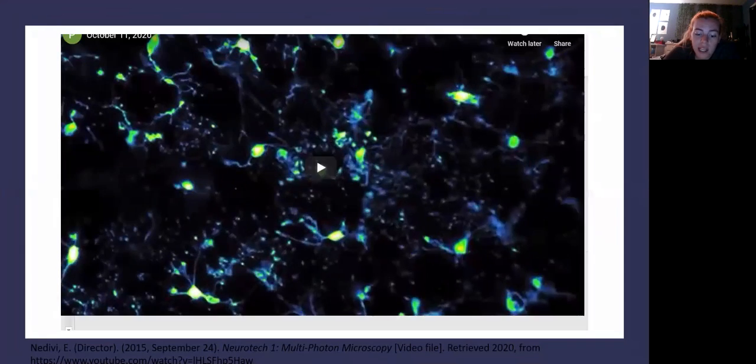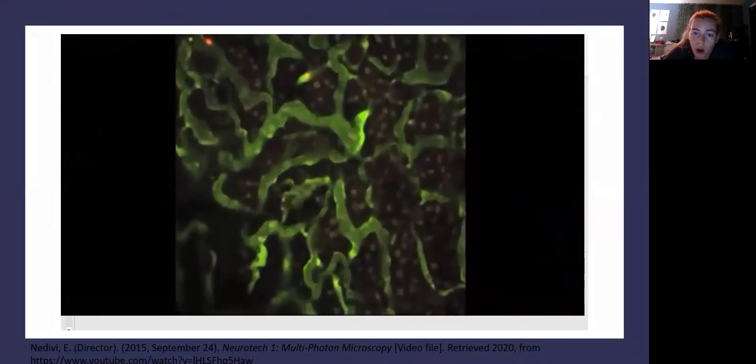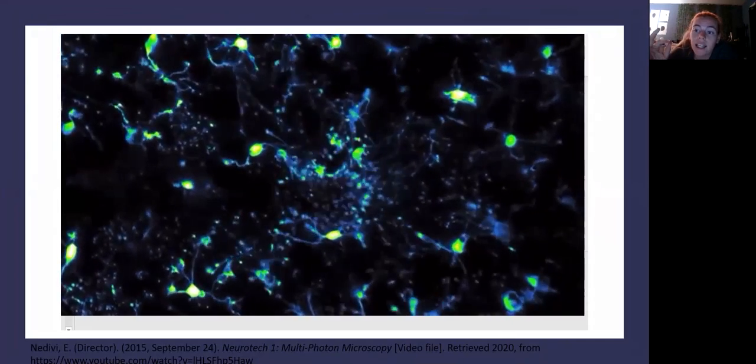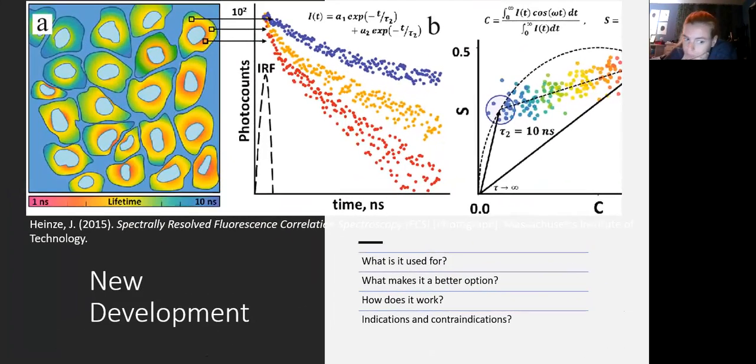They now use this modality to look at the cytoarchitecture of specific areas, due to the fact that they're able to watch it in real time, and then they're able to pinpoint it with a protein, and then use fluoroimaging to watch the pathway. It opened a whole new world to diagnostic imaging. Developmentally, it is still only tested on animals, fortunately. But the best part is that there is such a better understanding of cell arrangement and their function.